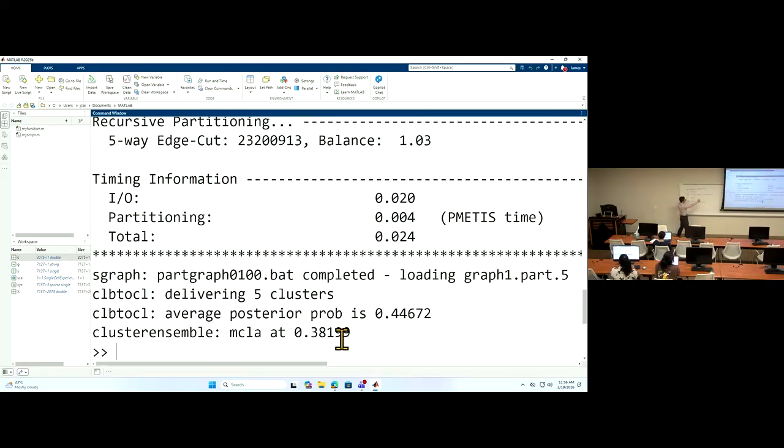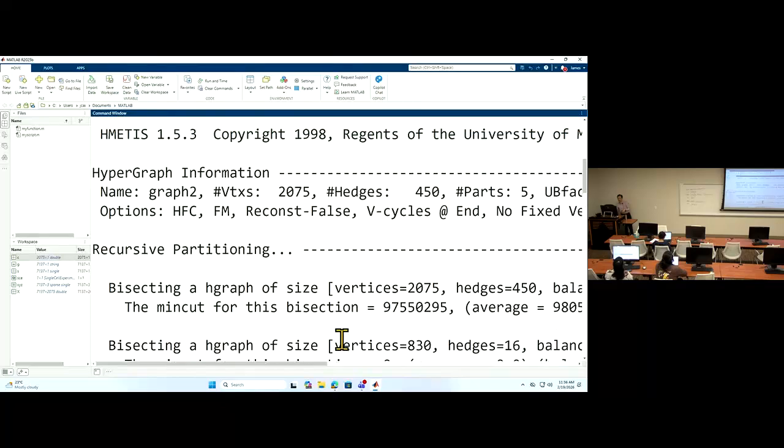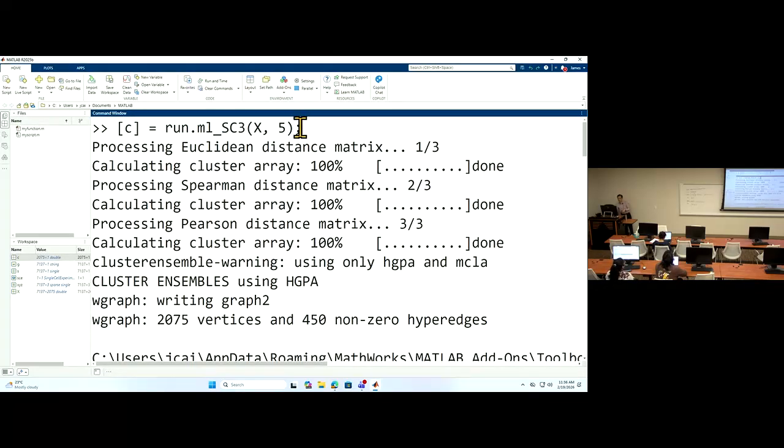Remember the procedure we had: the 3 distance matrices, and then transformation, and then the different ranges of the chopping. There's a lot of output.